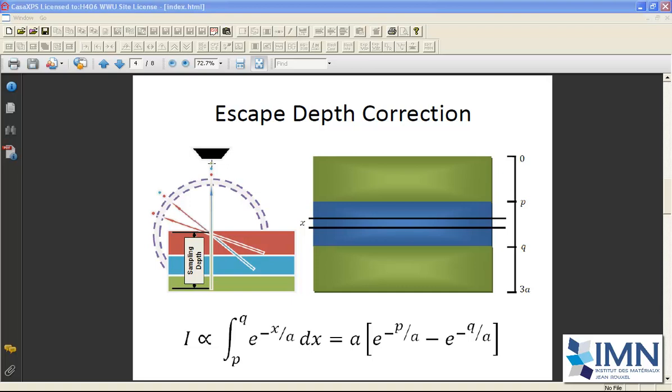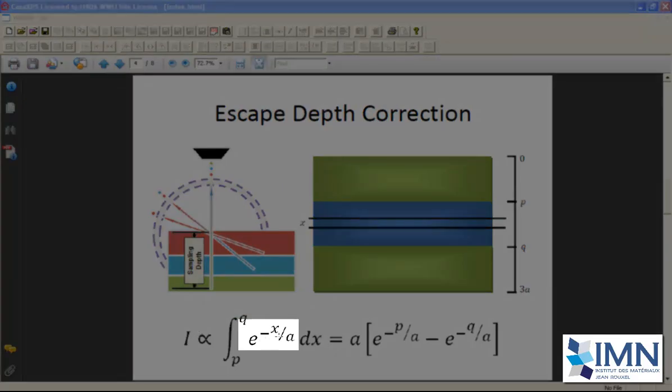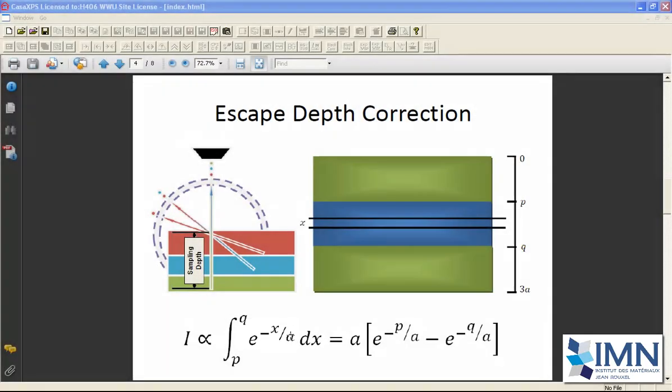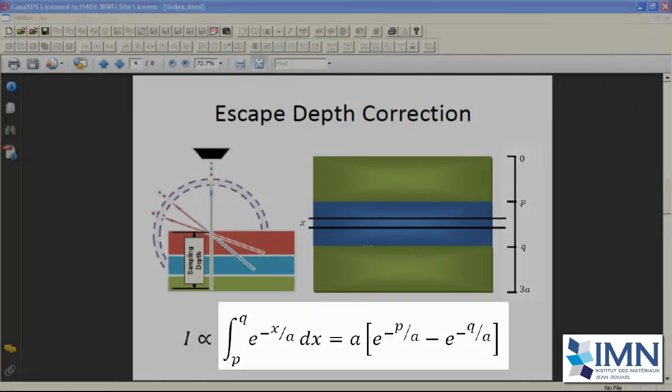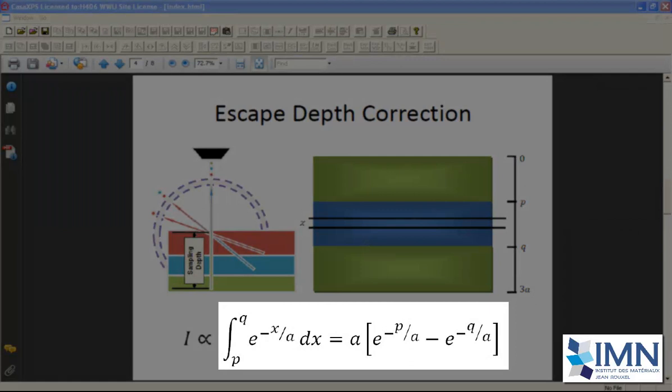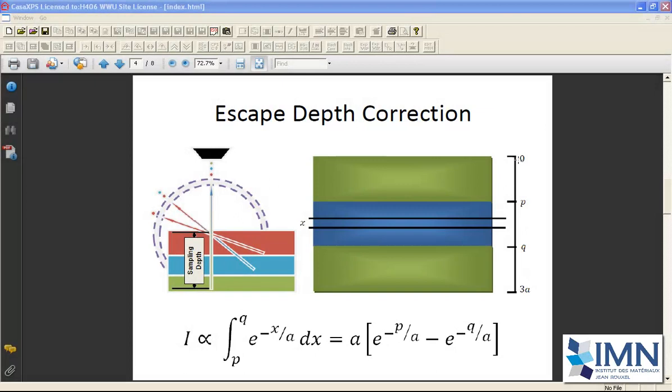But it does mean that the oxygen 1s signal is attenuated as a function of where the oxygen is in the sample. We have a model for working out how the intensity is altered as a function of depth within the sample, and that's this exponential model, which involves a parameter a, which is referred to as an attenuation length. And if we integrate from a depth of 0 through to 3a using this model, we can arrive at a conclusion, which is that 95% of the signal will derive from the top 3a's depth of the material.